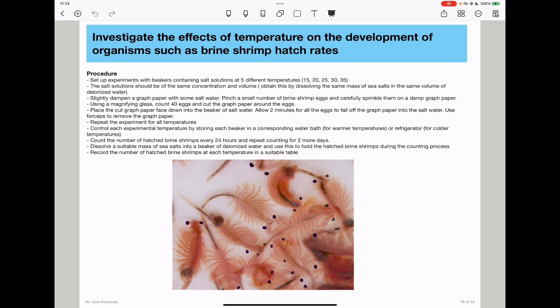We will count the number of hatched brine shrimp every 24 hours and repeat the counting for two more days. We will dissolve a suitable mass of sea salts into a beaker of deionized water and use this to hold the hatched brine shrimp during the counting process. Record the number of hatched brine shrimp at each temperature in a suitable table.